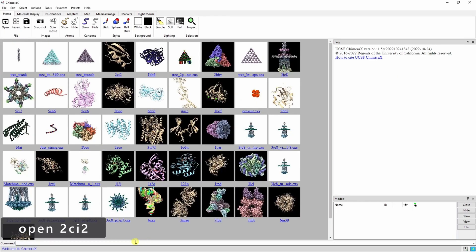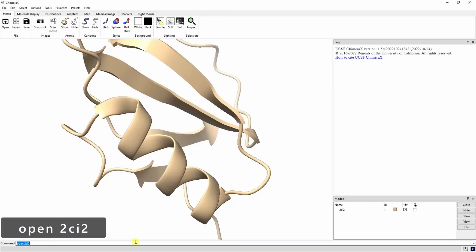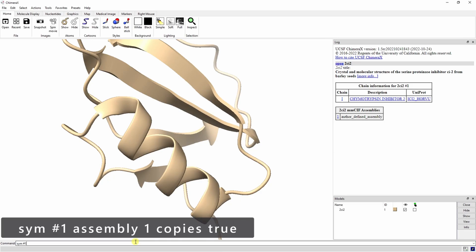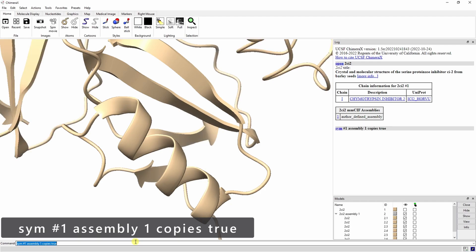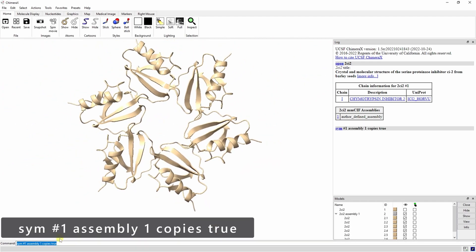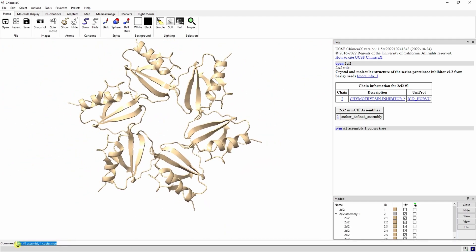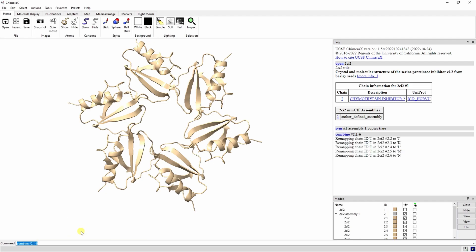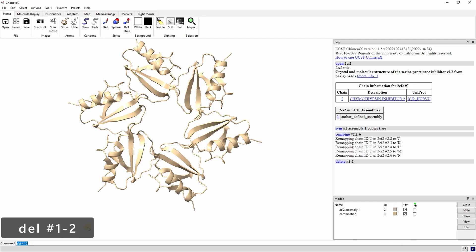Next, let's make a star from 2Ci2. This protein is a serine protease inhibitor. Using the sym assembly1 copies true command, we can make a symmetrical six-sided star. We can combine the six individual pieces with the combine #2.1-6 command. This combines submodels 1 through 6 of model 2. Then we can delete the original models and save this as a PDB.